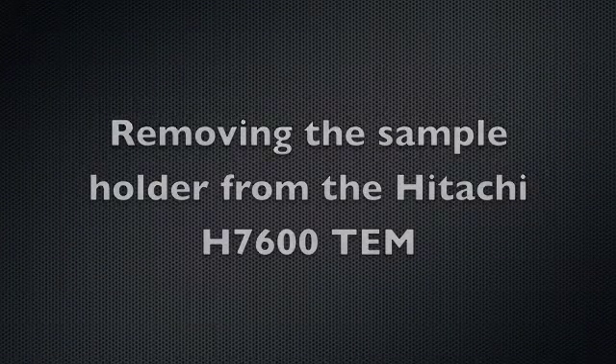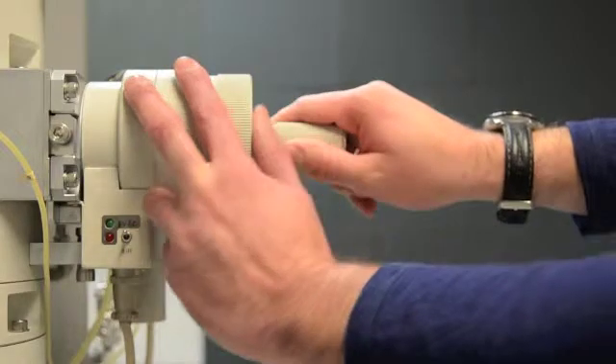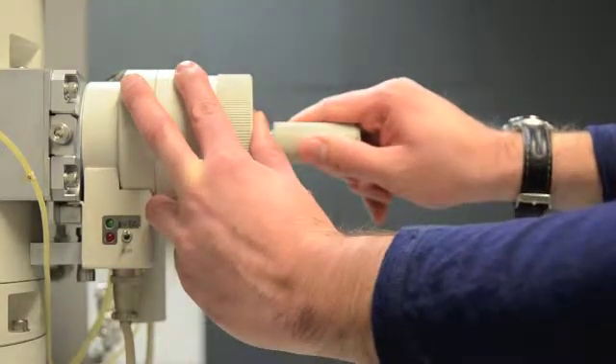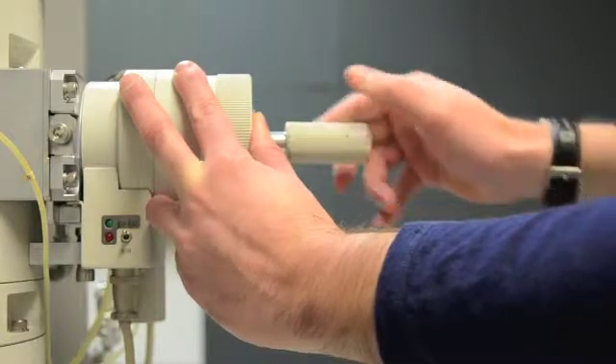To remove the sample holder from the Hitachi H7600 TEM, first support the stage with your left hand and pull the rod straight out, then rotate slightly clockwise to position B.